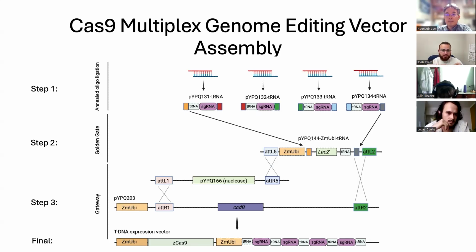Additionally, specific to the tRNA sequences, it turns out that they have some polymerase 3 activity, so they can actually recruit polymerase 3 to them as well, which can boost your gene expression per se, right? So those are a few advantages of using the tRNA strategy with the Pol II promoter.